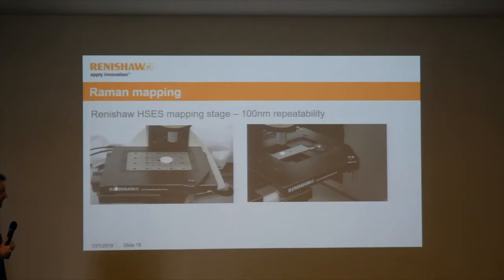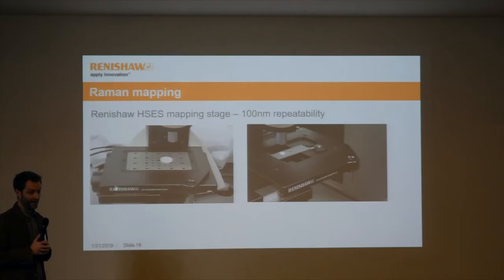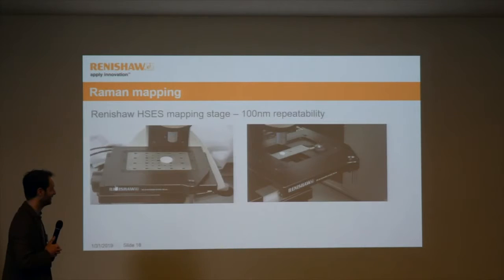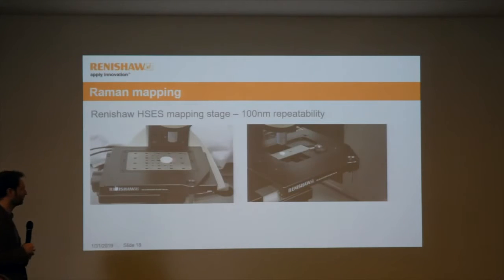We've designed our own stage because actually no stage on the market was good enough for Raman spectroscopy. Again, this cannot cover an A4, especially with 100 nanometer repeatability, but it's still got 11 centimeter travel in X and 7 in Y, which corresponds to, I think, an A5 or A6 probably. So to cover an A4, you would have to split it in 4, effectively.